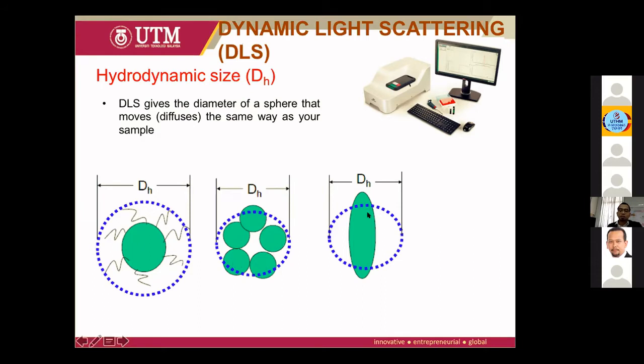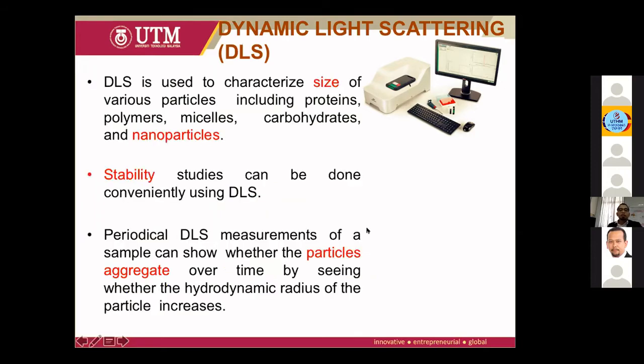Whether the shape is ellipsoidal or not, as presented by Dr., you have a different type of zeolite there, but we still count it as a sphere of the sample. Okay.